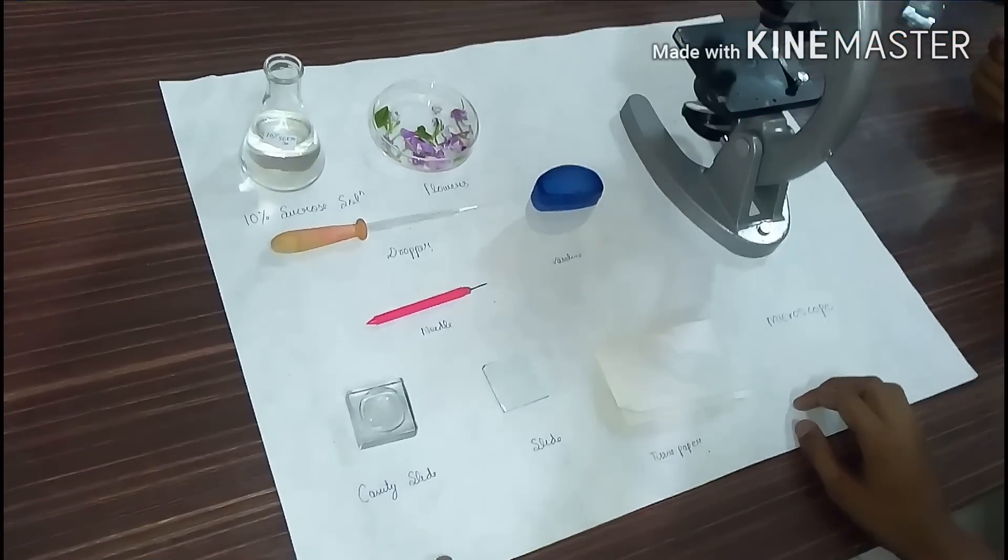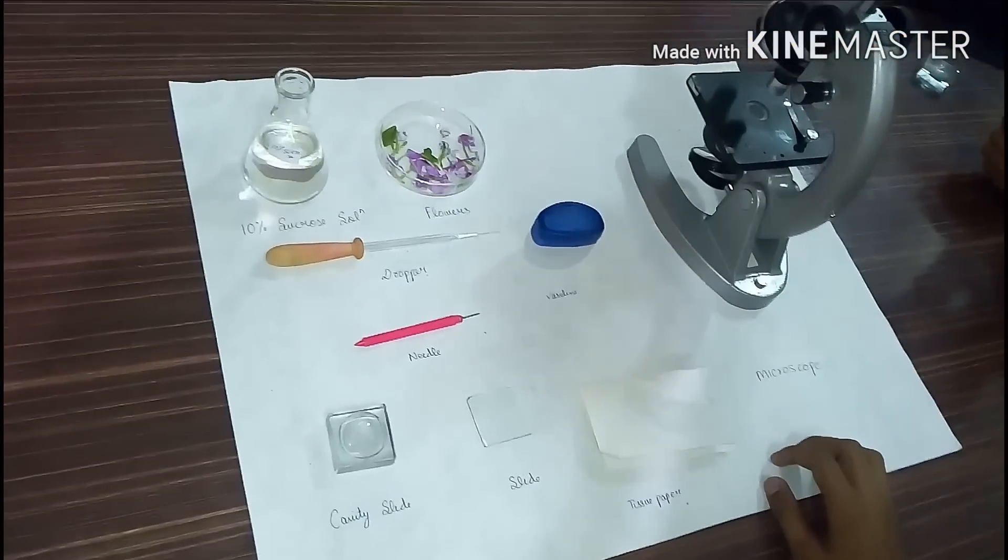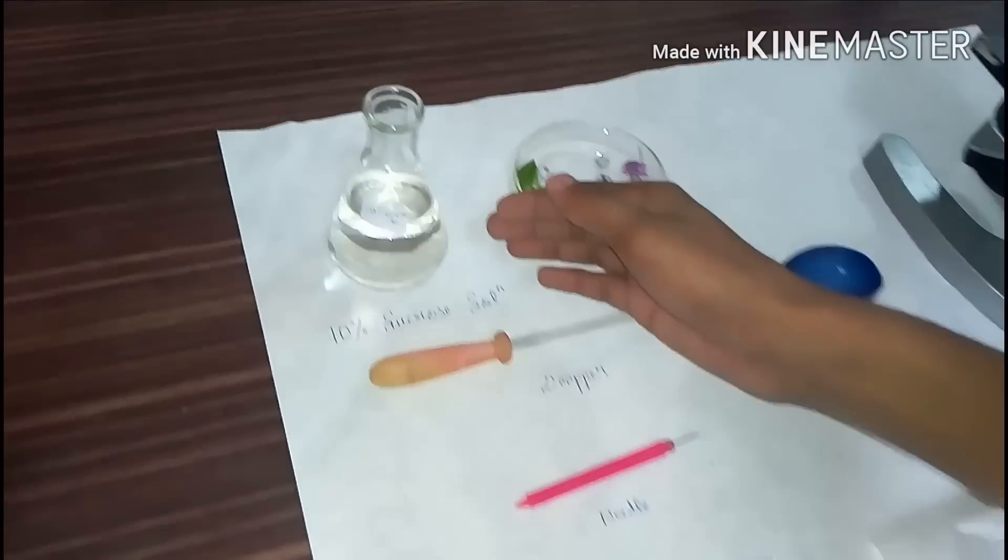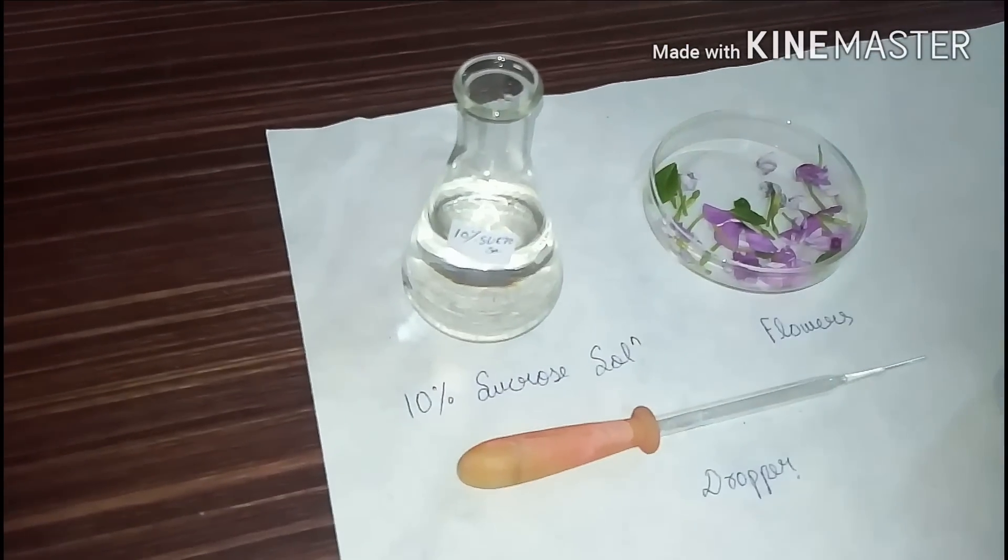Hello, and today we are going to perform germination of pollen grains by hanging drop culture. The apparatus we require is 10% sucrose solution for a nutrient medium.